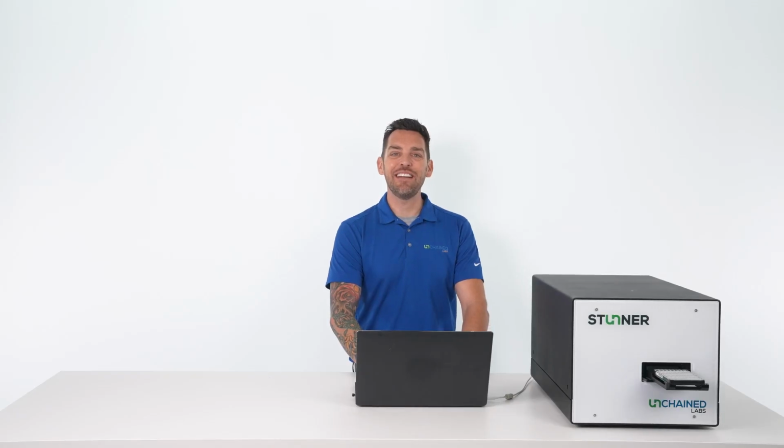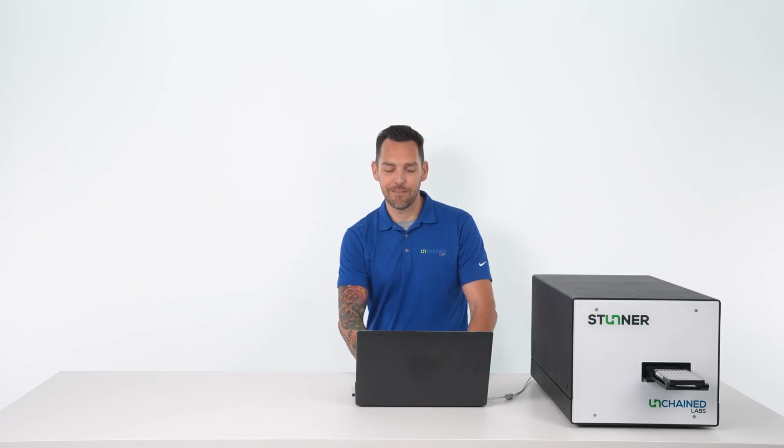And now we just pop in our plate and Stunner AF is going to dig up all that encapsulation and sizing data while we work on more important things.